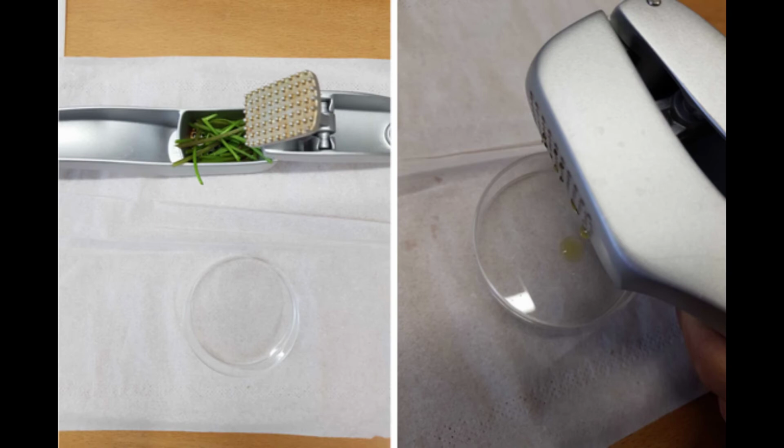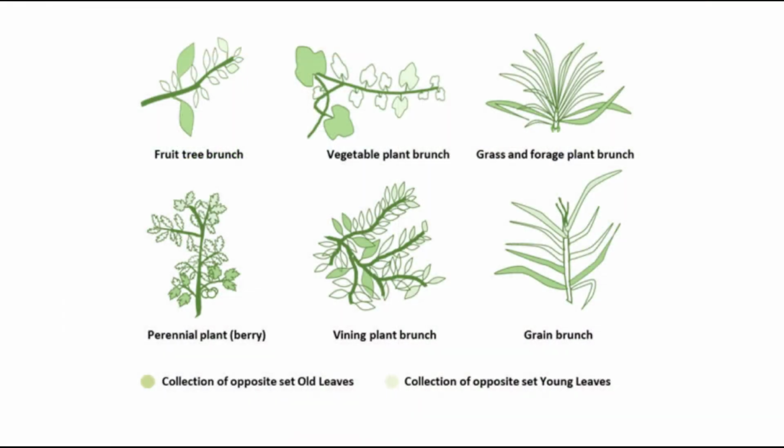The number of the petioles might increase significantly if they are poor in sap, as we need a final plant sap volume of 50 microliter in order to operate the measurement device correctly. This should be a guidance on what is meant by old and young leaf.